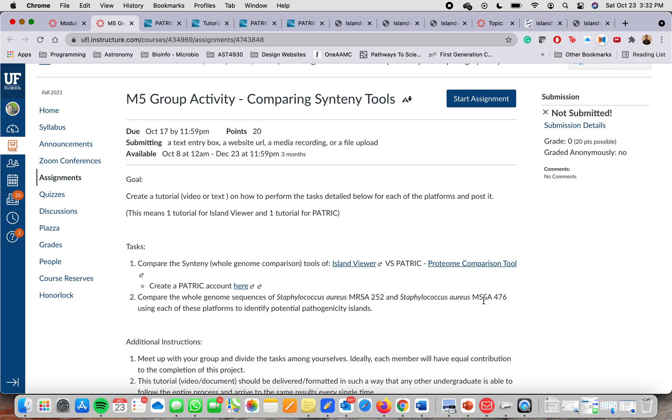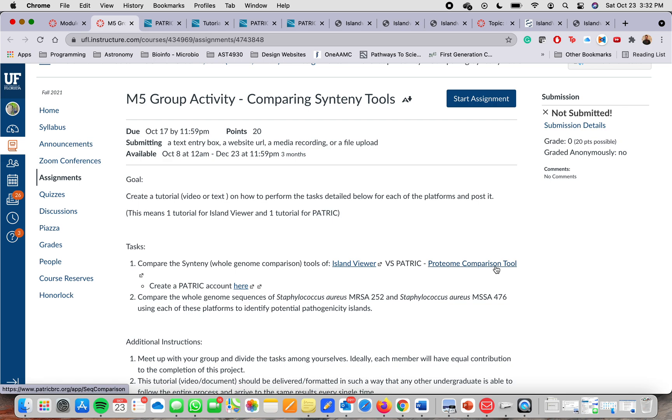The genome comparison tools that we'll be using are Island Viewer, which link is provided here, and PATRIC, which is a Proteome Comparison Tool.